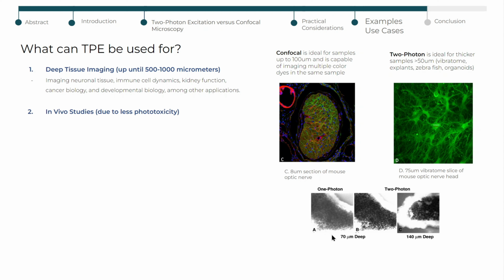TPE is also great for in vivo studies, thanks to its low phototoxicity. It could be used in longitudinal studies of neuronal activity, immune cell dynamics, and metabolic processes, as well as investigations into disease progression and therapeutic responses in living organisms.